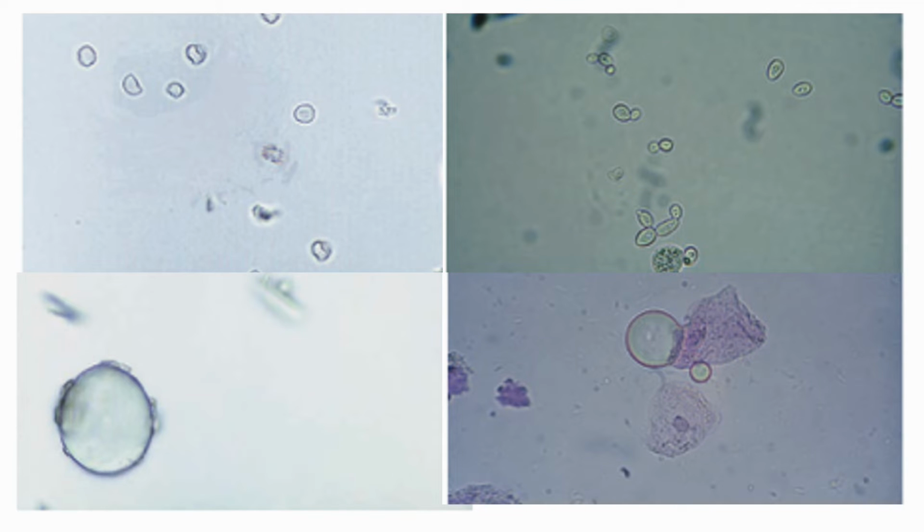The oil droplets and the air bubbles are highly refractile when the fine adjustment is focused up and down, and they may also appear in a different plane than the other sediment constituents.